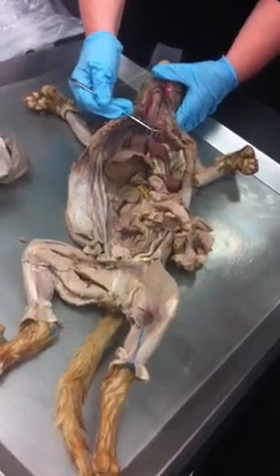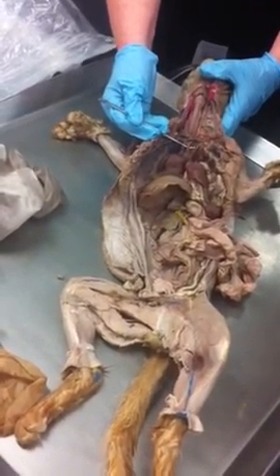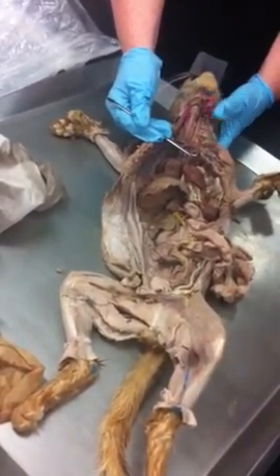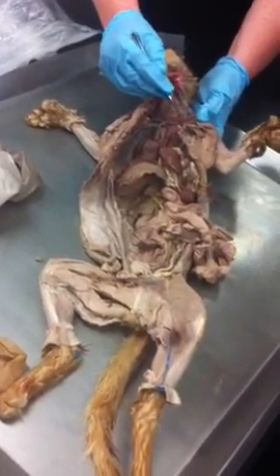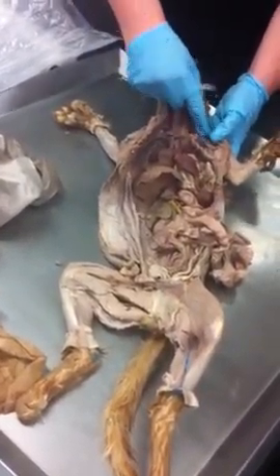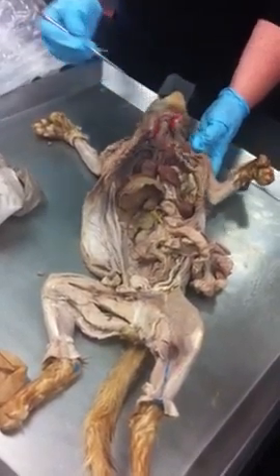What is this branch coming off the aortic arch? Brachiocephalic trunk. Make sure you say trunk or artery. And that makes this one? Yeah, and just follow it on out so your vein is a lot easier to follow. And there's going to be a subscapular. That's the one that's kind of diving in up towards the shoulder. And what you want is this one that goes out to the middle portion of the arm. So there it is, subclavian artery and vein.